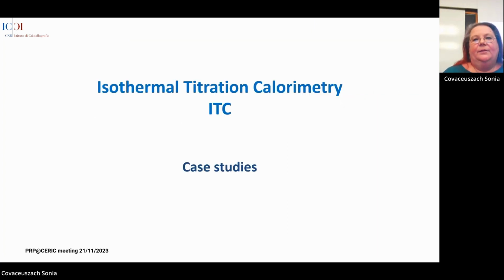I will present you three case studies, experiments we performed in our facility, and unfortunately they are all about the interaction between proteins and small molecules, even if there are apparently no limitations in the molecular weight of the interactors.